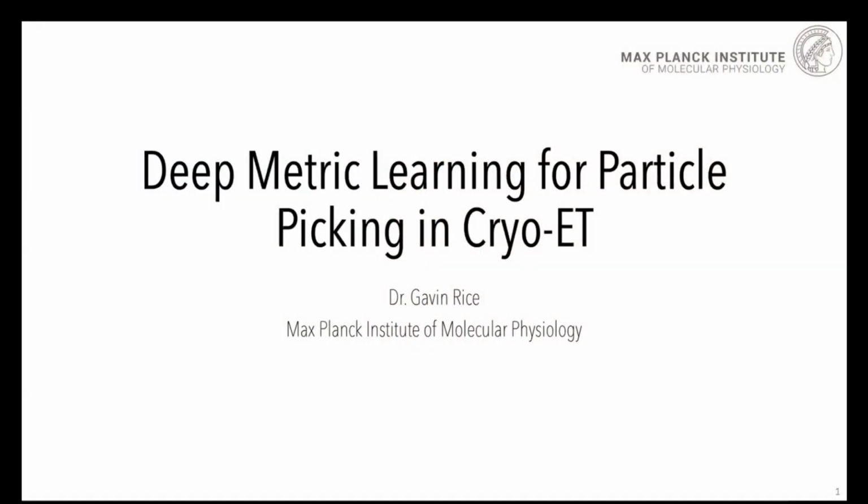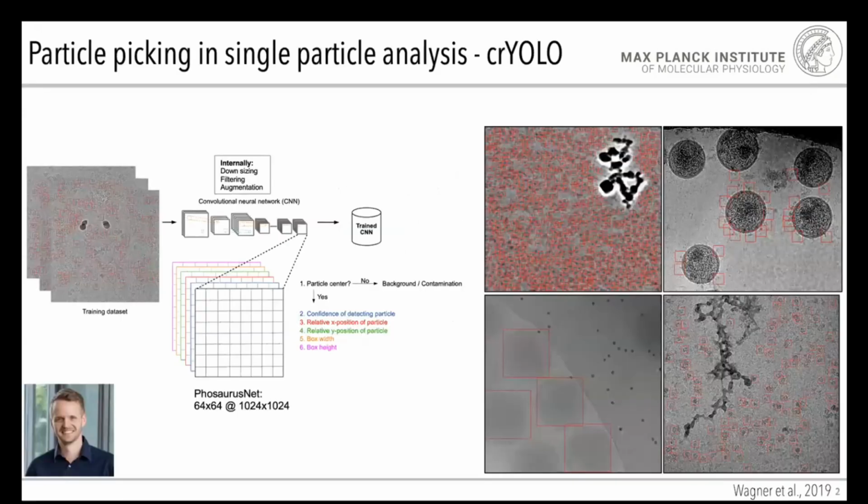So let's talk about representation learning. We use deep metric learning for particle picking in Cryo-ET. Before I talk about that, I'd like to get a little bit of context, although I don't think I need to convince many of you about why I think this is important.